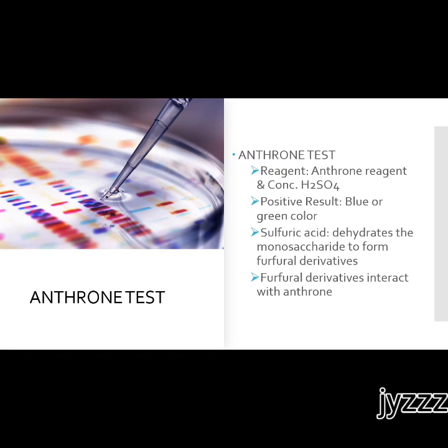These furfural derivatives will interact with your anthrone to produce a blue to green, or blue-green, color. That is for your anthrone test.